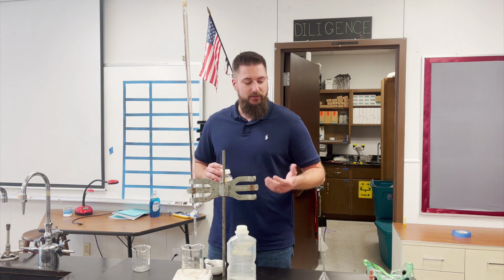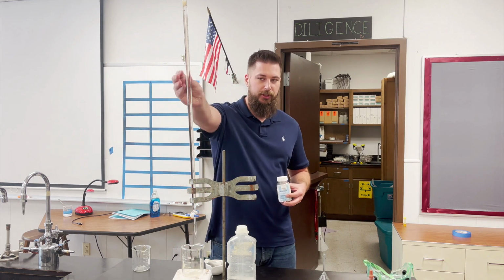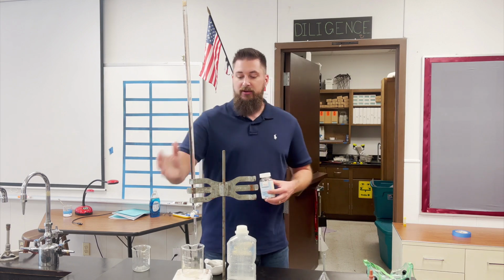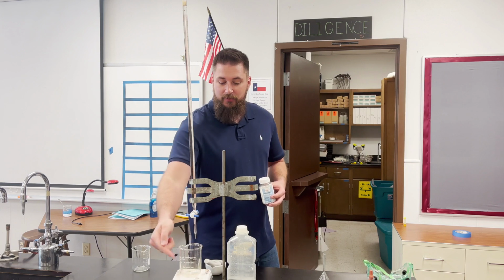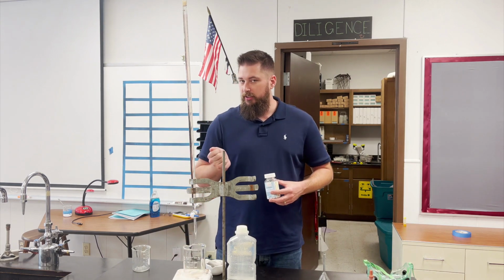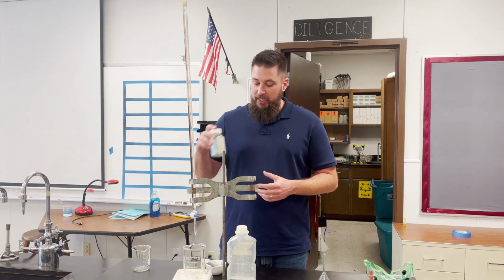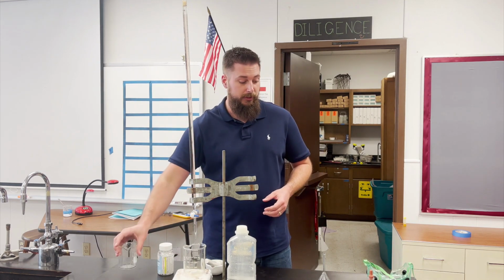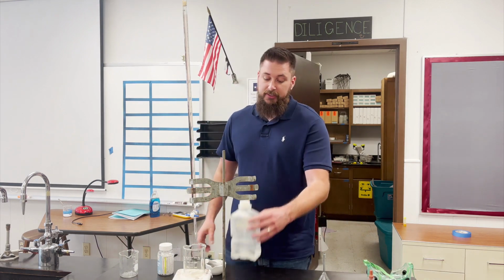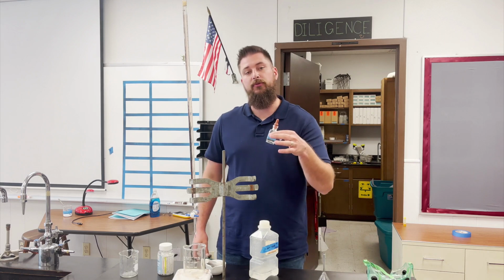So let's go ahead and get started. I'm going to explain what we have here. We've got our burette. We have a beaker here. Inside there's a magnet. We've got a stir plate there that will actually spin the magnet. I'll show you that in a little bit. We also have our aspirin. We have an extra beaker on the side, and I'll show you that for a moment. And we've got our sodium hydroxide and our phenolphthalein.